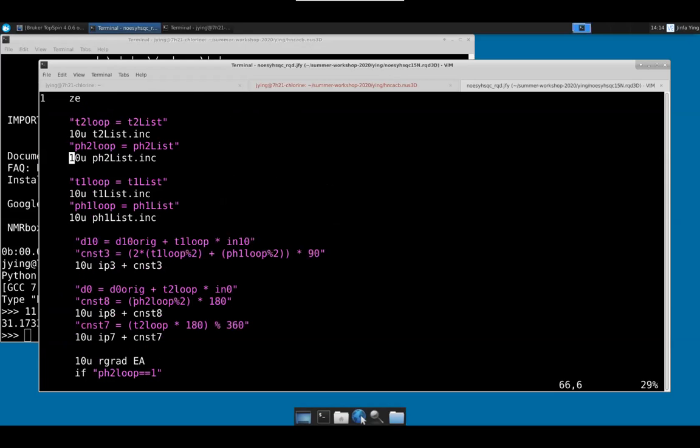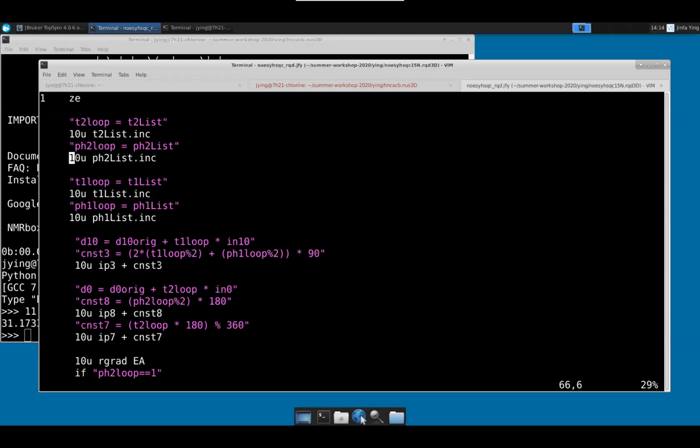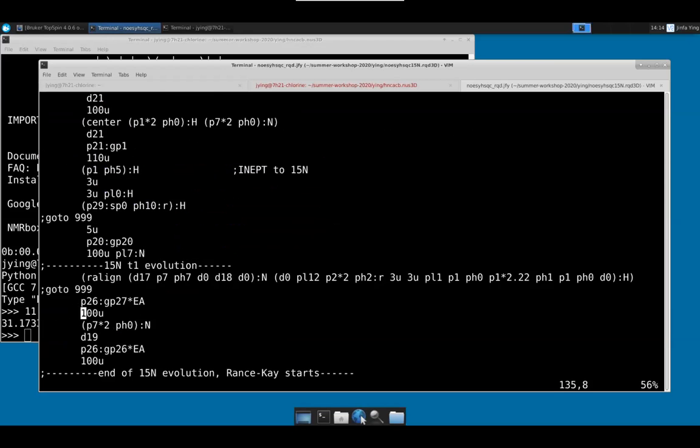And then before the pulse program starts, you have to read those values from the list and then calculate the increment and decrement value. And then you also calculate the phase increment and you set them. And that's it, really, the regular pulse sequence.